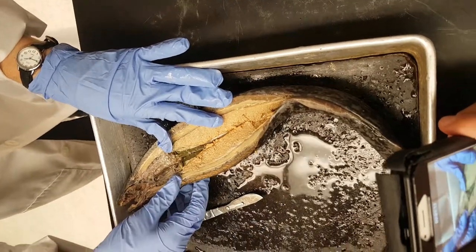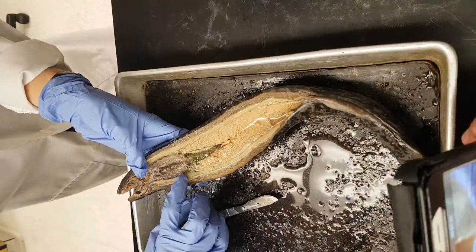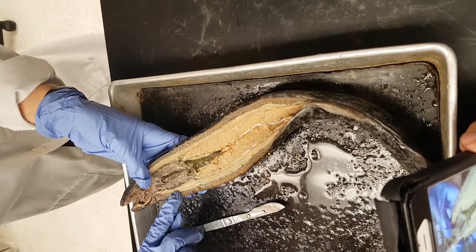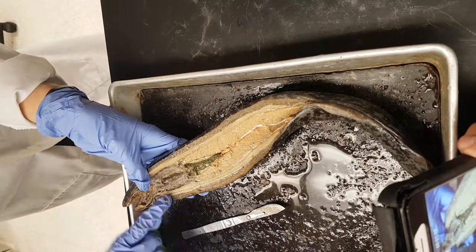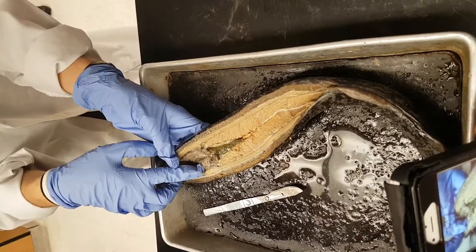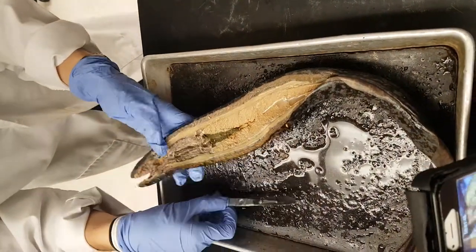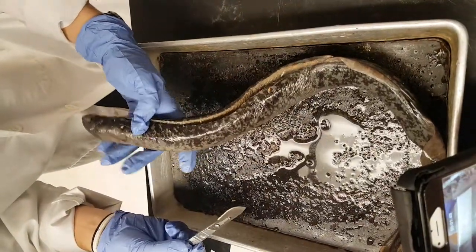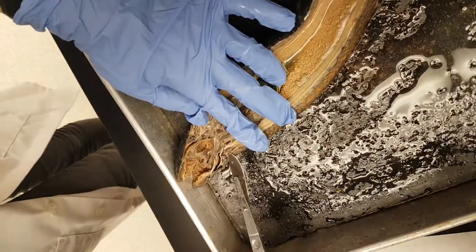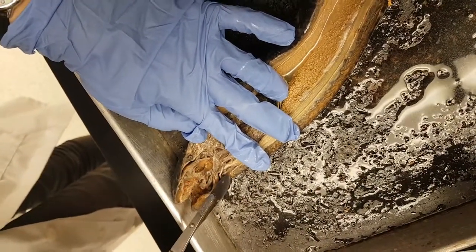Your notochord is going to be this line here. It is ventral to your dorsal nerve cord, which is this part here. You can tell the difference by the color, though don't use that as a distinction. This is your notochord, the lighter part, and then your dorsal nerve cord is right above it. The brain is going to be this part right here. Here is your eye, and here is your brain. You can see it's kind of cut in half, so you have eye and then brain.